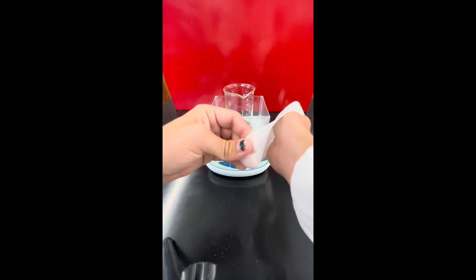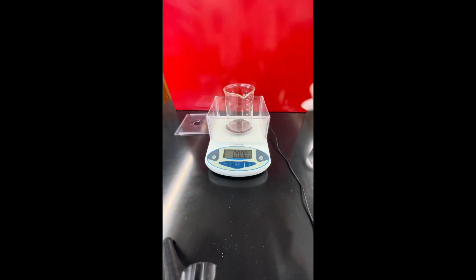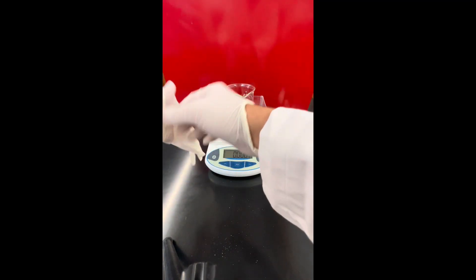Hey guys, today I'm going to be going over my first attempt at the alkaline electrolysis of sodium zincate, and I'm going to be demonstrating why you probably shouldn't try it at home.